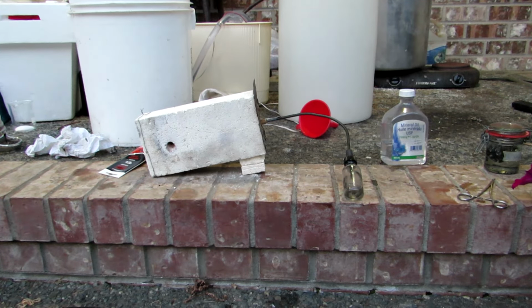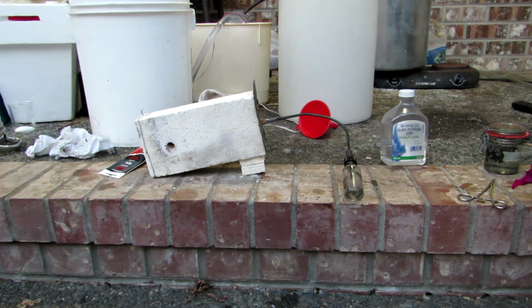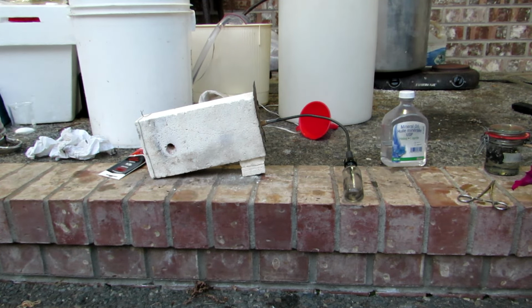A screw cap with a steel brake line welded on was attached to the tube, and then everything was placed inside of a hollowed-out refractory brick with a hole in the side. The apparatus was placed on a slight angle to keep the reaction mixture in the bottom of the tube, and the output line was inserted below some mineral oil to collect the potassium as it distills over.